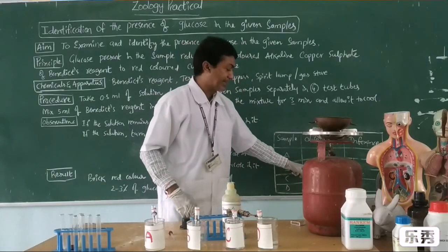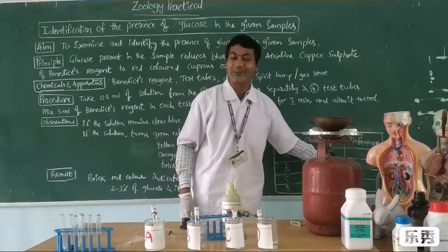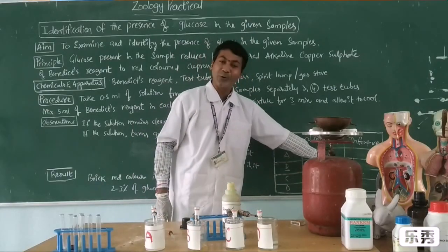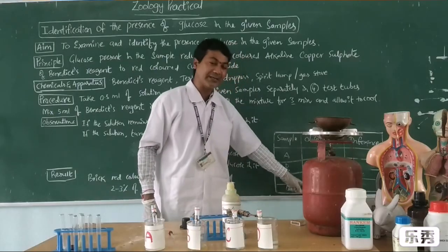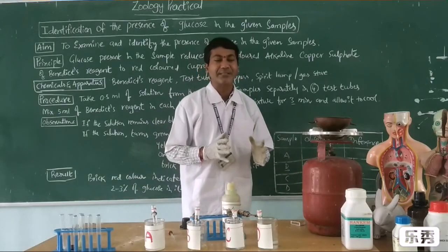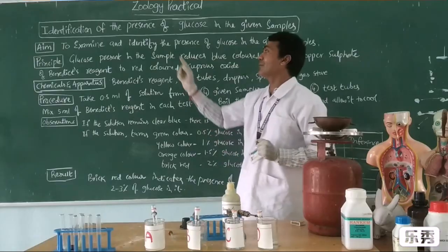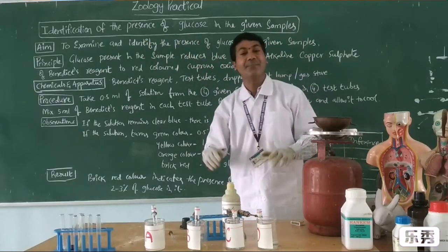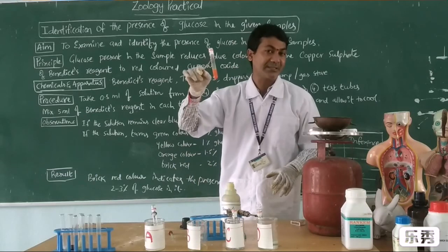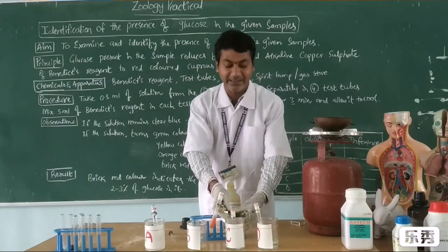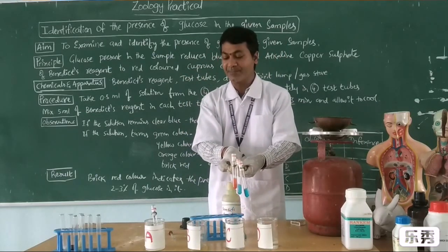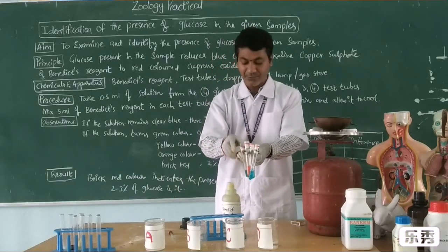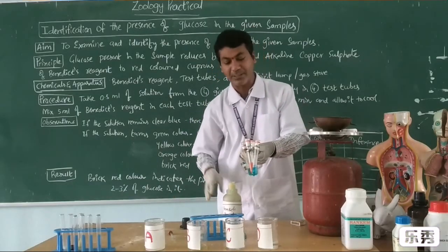B turns into red color — 2% of glucose is present in the sample. C remains blue — no glucose found. D remains blue — no glucose found. This is the result regarding the presence of glucose in the given samples. One test tube turns into reddish color, whereas all the remaining ones are showing the same color of Benedict's solution. Thank you all.